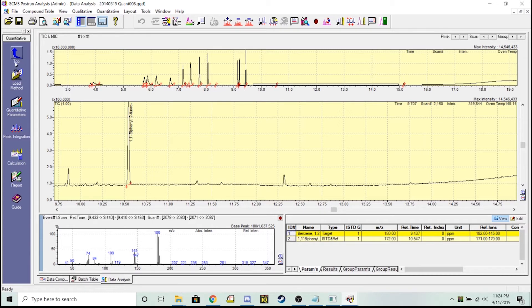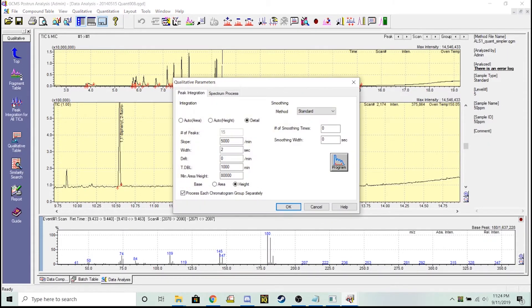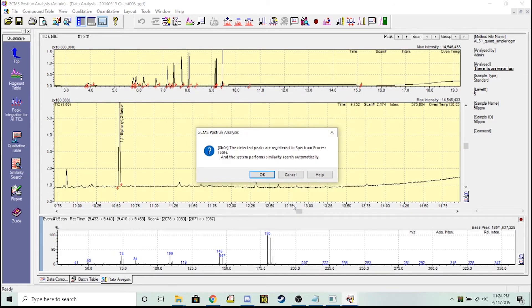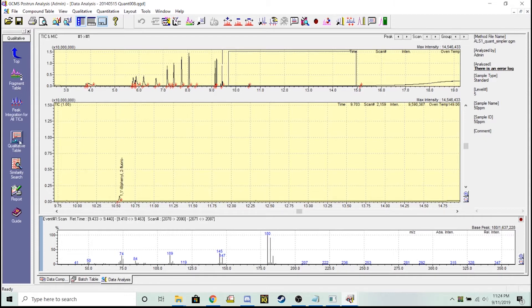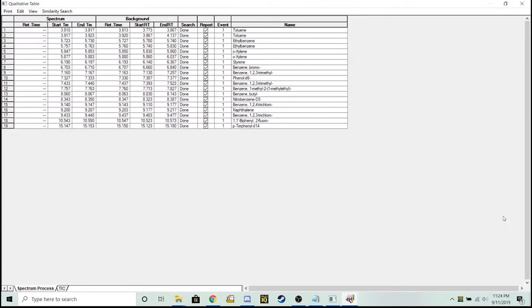Let's go back into qualitative. Peak integration for all ticks - I'm basing it off of my height. I've got 80,000 selected here and then 5,000 is a good number to use for my slope. I can hit okay.